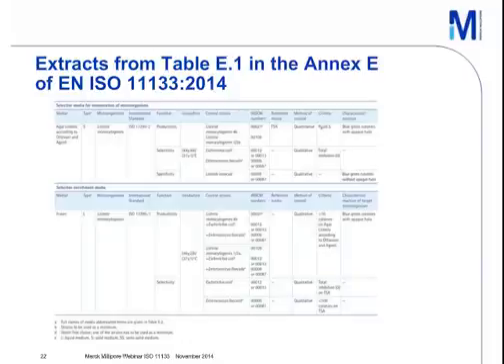In this kind, all media from ISO standards are described here in this annex in Table E for the food microbiology and Table F for the water microbiology. Also for the selective enrichment media, here we have an example in the part below for Fraser Broth. Fraser Broth, as you see in the control strains in the middle, is tested by a mixture of Listeria monocytogenes mixed with Escherichia coli and Enterococcus faecalis. And the selectivity is then tested only by Escherichia coli and Enterococcus faecalis single.